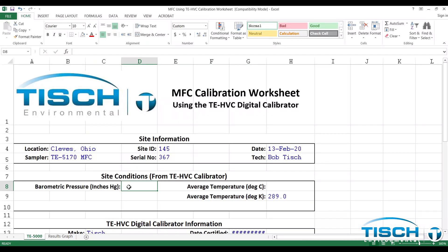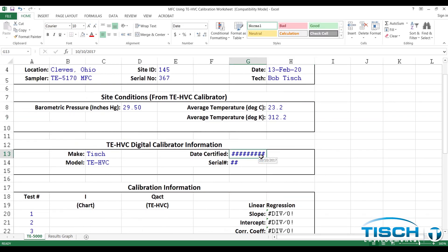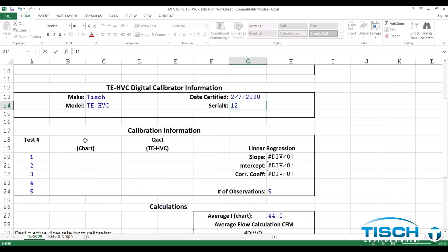Enter in the site information and then enter in the site conditions from the TE-HVC Calibrator. Then you will need to enter in the TE-HVC Digital Calibrator information. Next you will need to enter the calibration information from the calibration procedure. First, enter the chart readings.